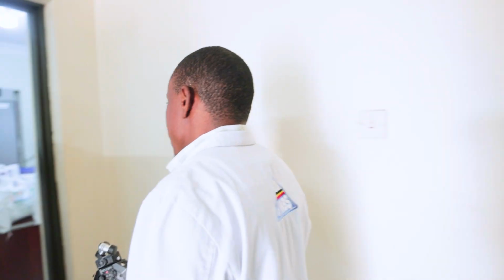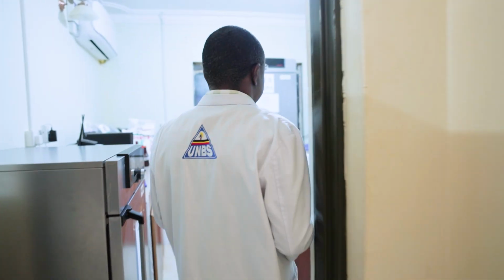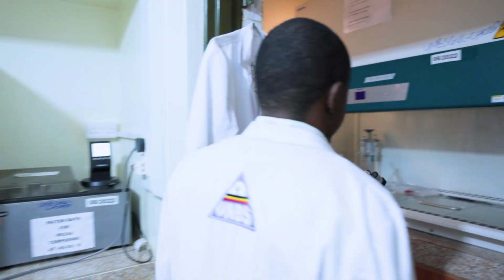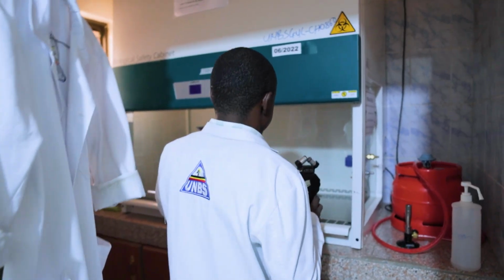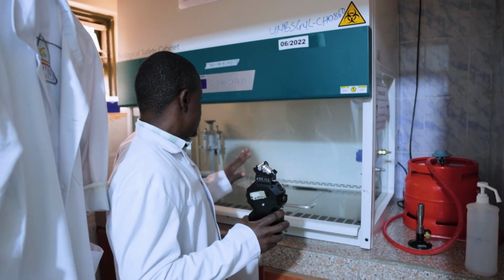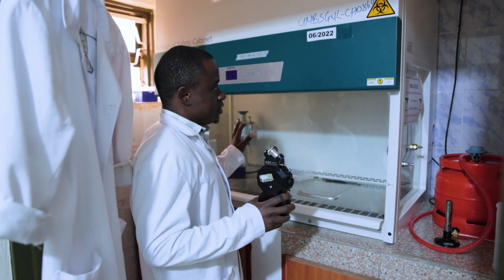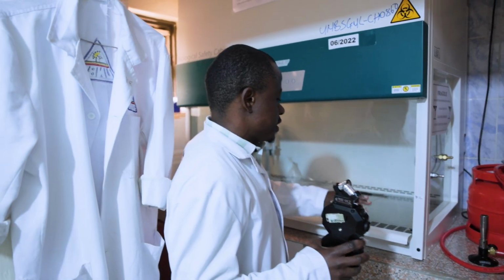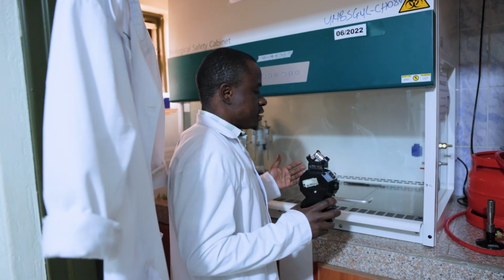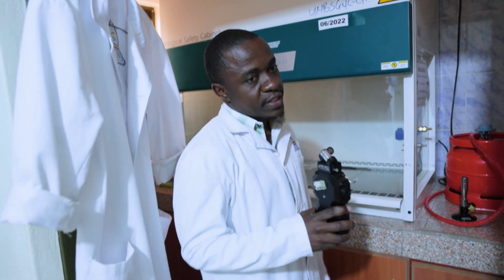So this is our main lab, this side. In here we have the biosafety cabinet. The analysis of the samples happens from here. It is a sterile environment. This is where we do the actual analysis from. Then after preparing our analysis, we put it in an incubator.